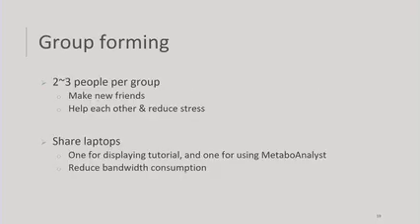To reduce that, and you may also make new friends, form a group of two. One displays either the slides or the tutorials, and the other just clicks the buttons. So it's usually best to have one screen for the slides, one screen for just MetaboAnalyst. Okay.